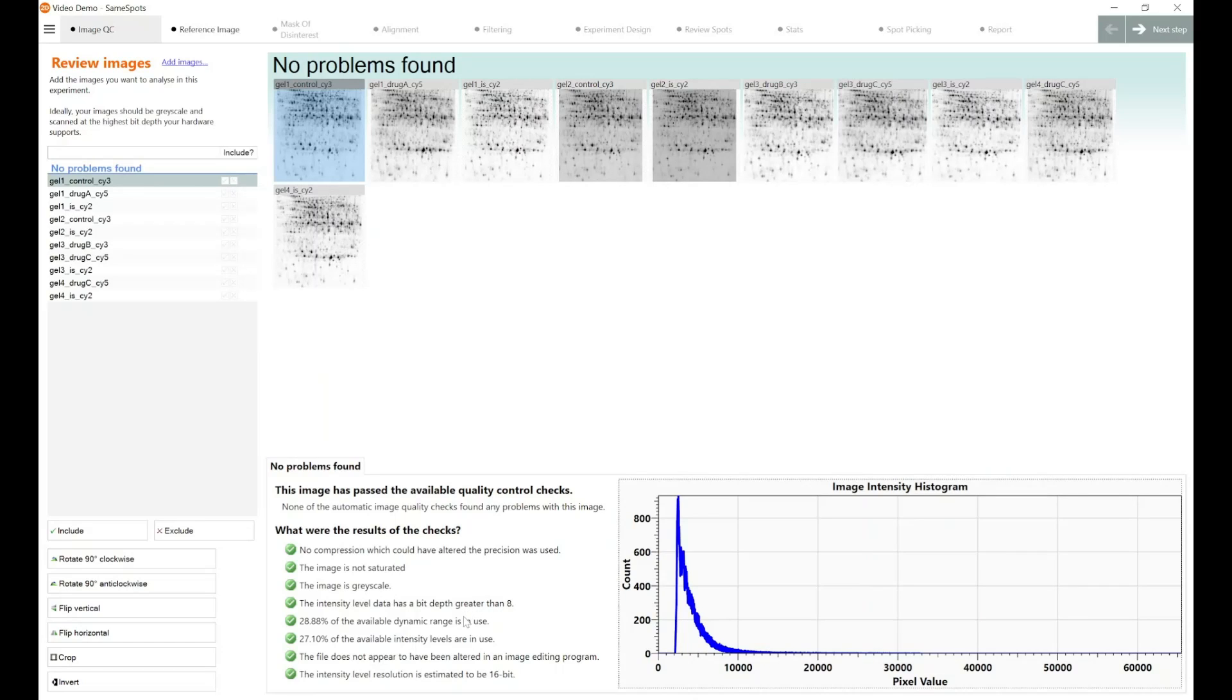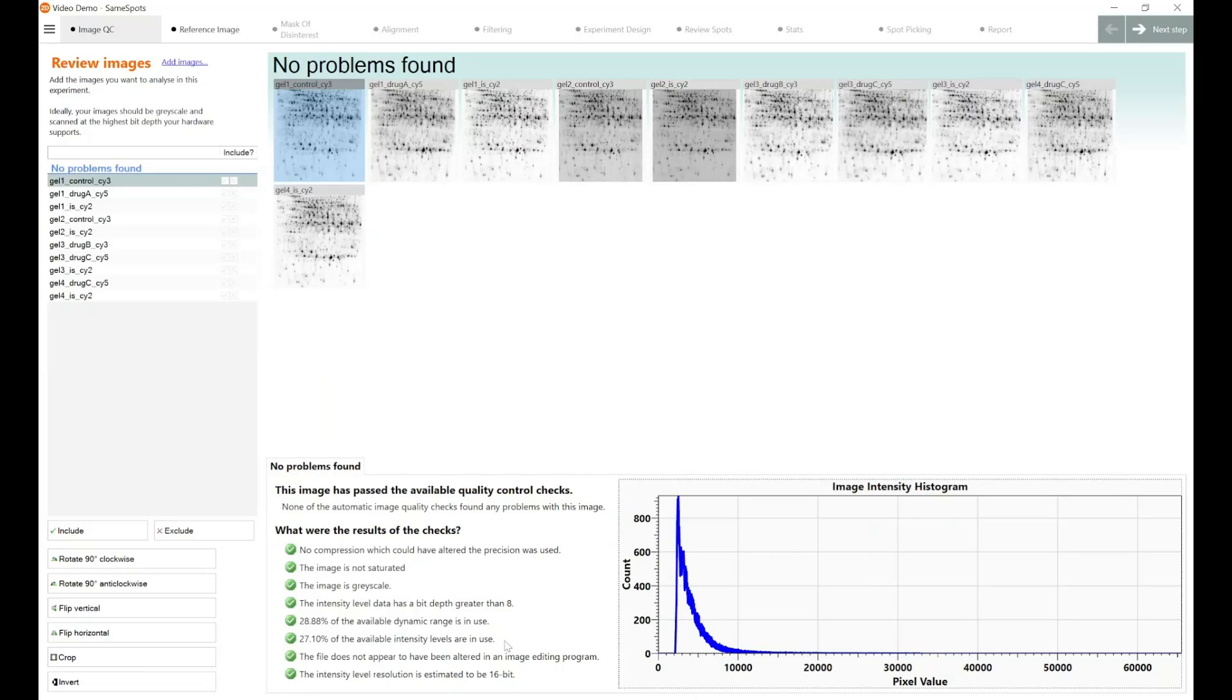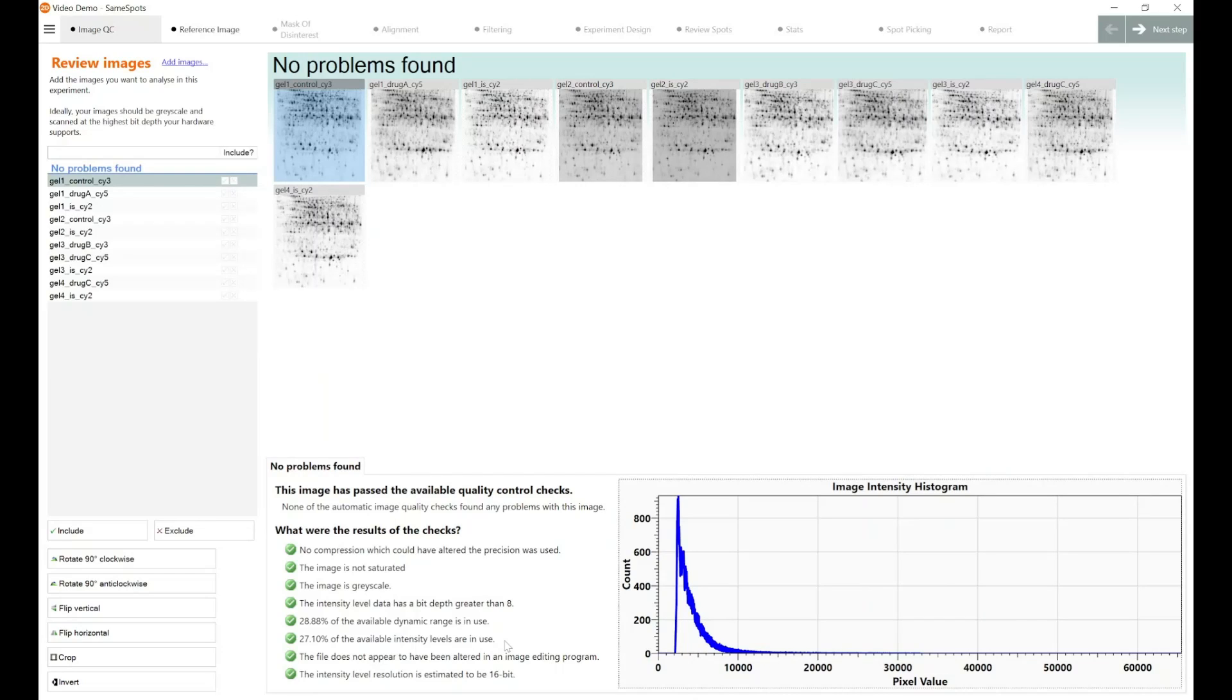28% of the available dynamic range is in use, and that relates to just the dynamic range of your image and your imaging device. 27% of the available intensity levels are in use. This relates to not having a saturated image. So of 100% of your dynamic range and 100% of your intensity levels, you're only using a small percentage. This doesn't really matter as long as it's not 100%, because as soon as it reaches 100%, you know that you've got the potential for data loss within either your data lies outside of the dynamic range of your device, or the intensity of some of your spots lies outside the detectable range of your device. And that's where you would lose data, and you wouldn't know.